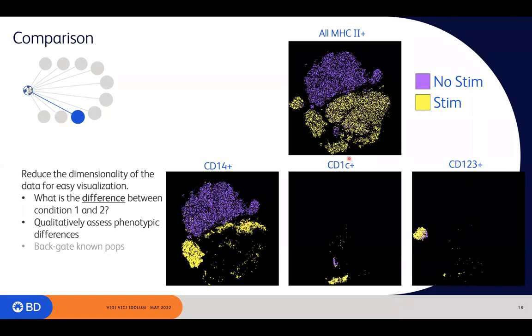Okay. Same thing if you had, in my case here, a dendritic cell gate, gating on CD1C. You can see that in a non-stimulated state, they occupy a particular location, and then when you stimulate them, they enhance, probably in frequency. I didn't put the frequency gate here, but I'm just inferring that there are many more cells once you've dumped the stimulus on it than you had when you didn't stimulate.